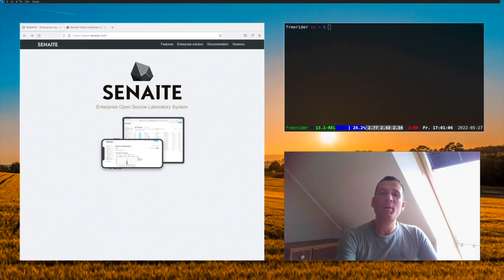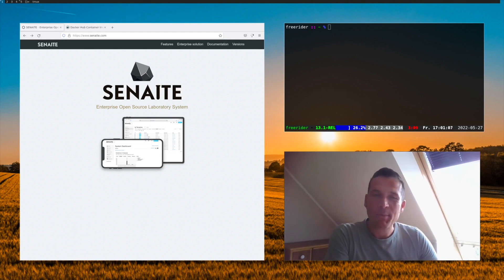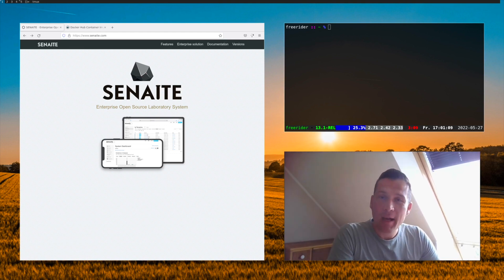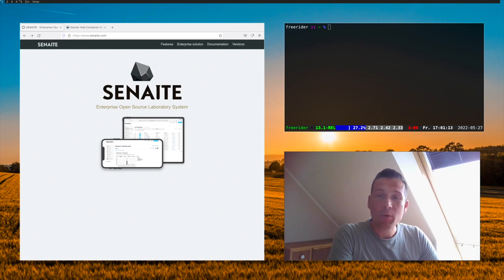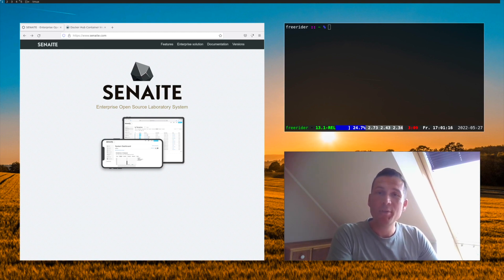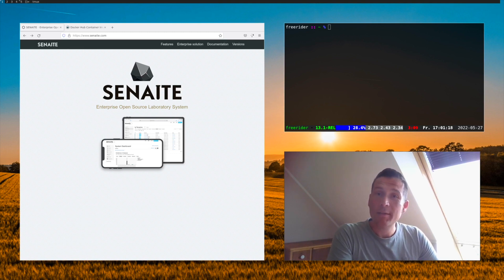Hello and welcome everyone. My name is Ramon. I'm one of the core developers behind the Senn8 LIMS open source project and today I'm going to show you how you can run the latest version by using a Docker container.